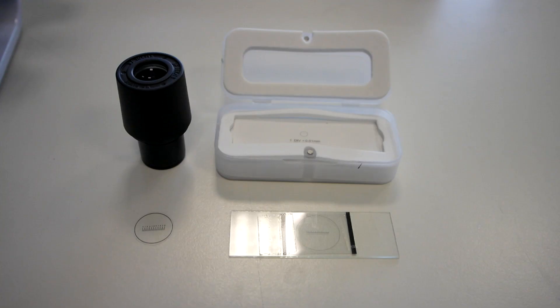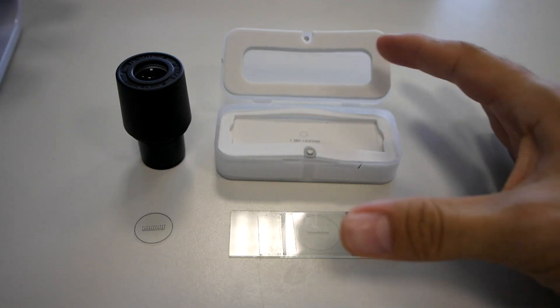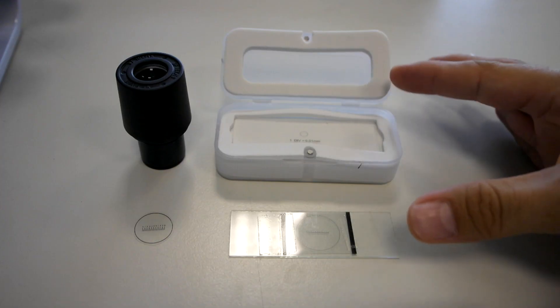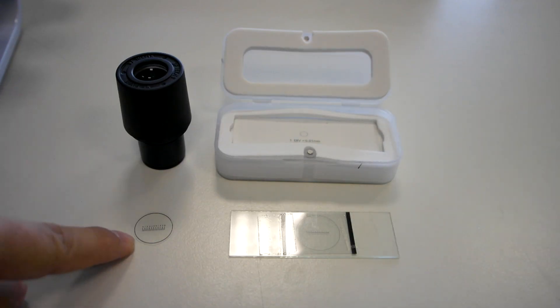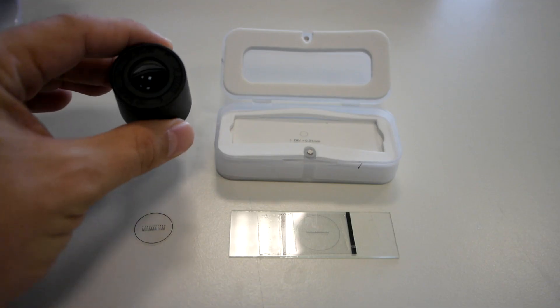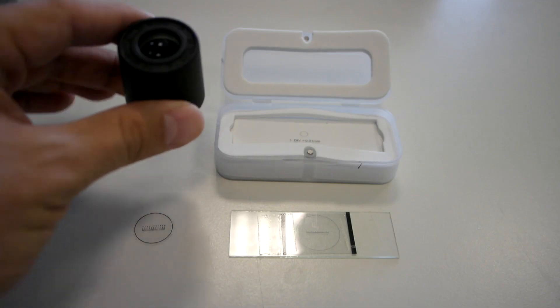Hello everyone. In this video I'm going to show you how to calibrate the eyepiece graticule using a stage micrometer. What you see here on the right side are two different versions of stage micrometer, and what you're looking at here is an eyepiece graticule — the plastic one and the glass one, which is engraved into the eyepiece lens.